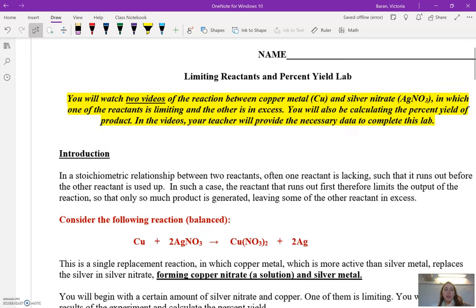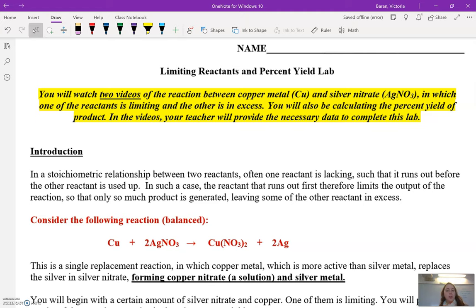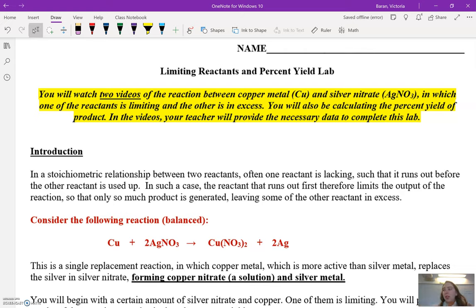So I'm going to start here. You're going to watch two videos. I'm going to perform the reaction between copper metal — just this copper wire — and silver nitrate, AgNO₃. One of those is the limiting reactant and the other you'll have excess of. Part of your goal in this lab is to figure out which reactant is limiting. You're also going to calculate the percent yield of the product.